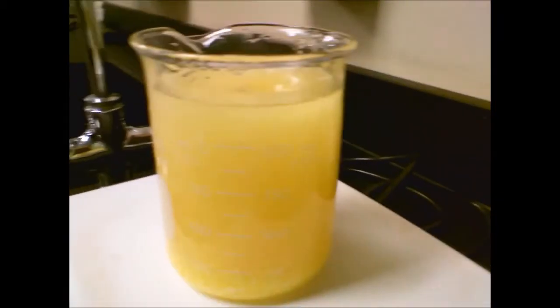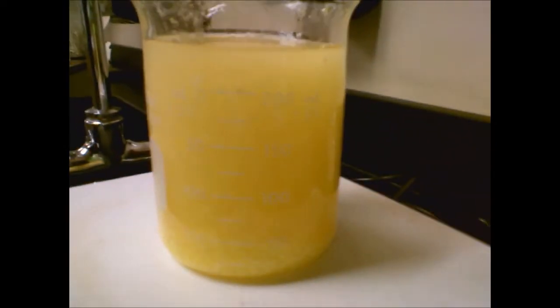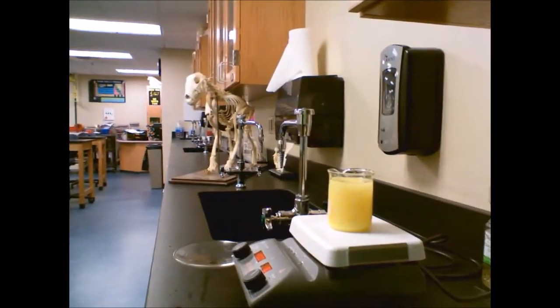Anywho, we now have, I'm just going to bring this closer, a solution, much more yellow. We still have cloudiness. All right. I'm just going to keep moving you around, of course.